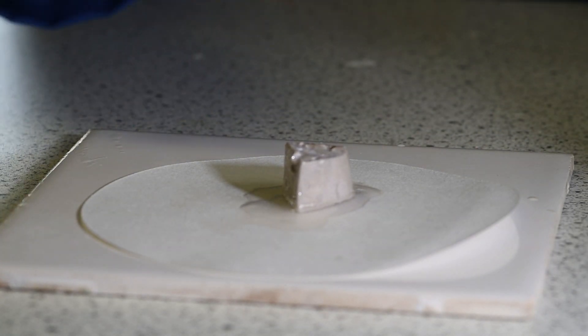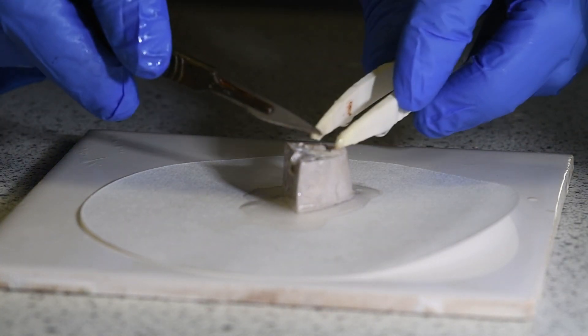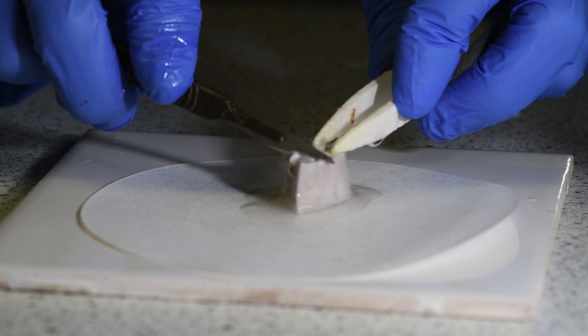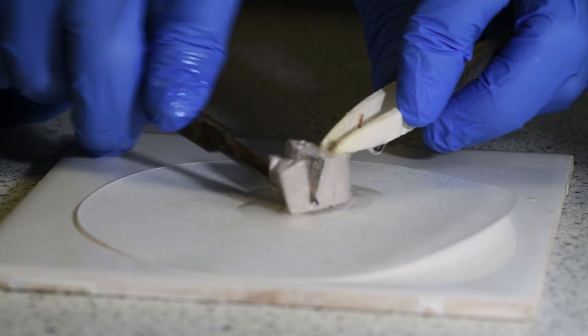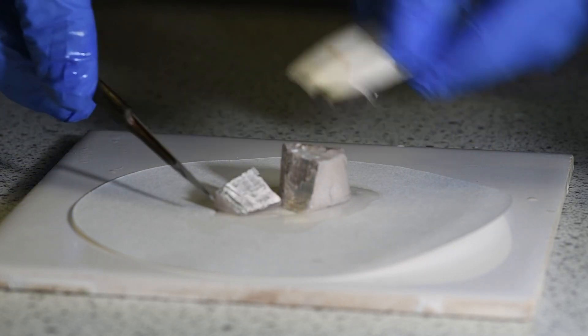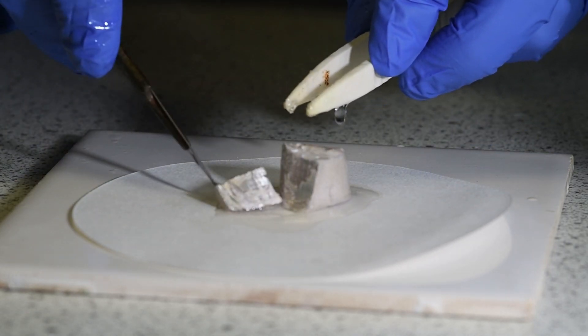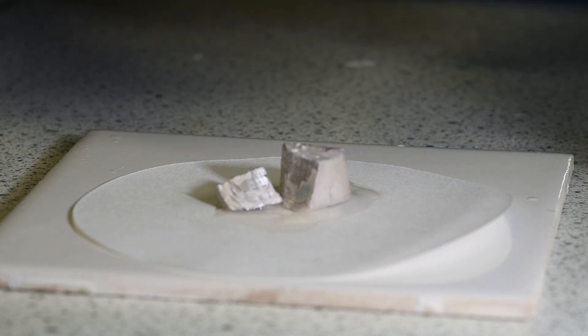You can see that sodium's a much paler color than the lithium. And if I cut, it's still quite soft. And you'll see the cut surface there shiny, but it tarnishes really very quickly.